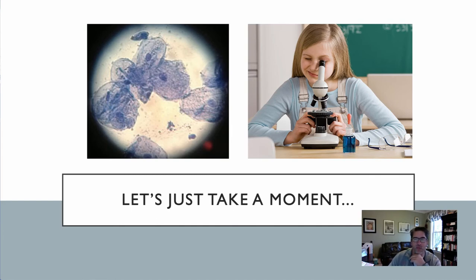I remember being in biology class, and we took the toothpick and scraped the inside of our cheek and put it onto a slide and stained it and did all that stuff. Probably made a mess of our clothes, and then looked at it under the microscope. Well, what we saw then was cells from inside of our mouth, and those cells are epithelial cells, right? No surprise there, but keep that in mind because you're going to need that information in a minute.